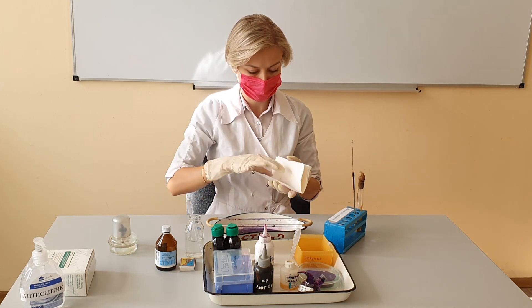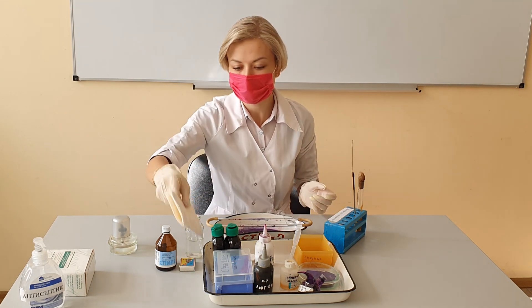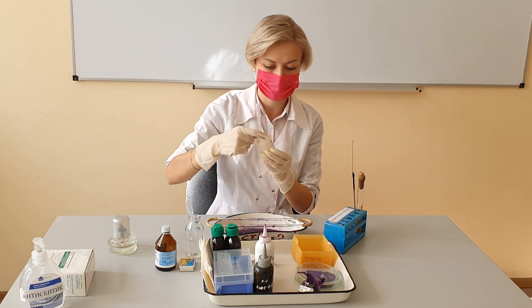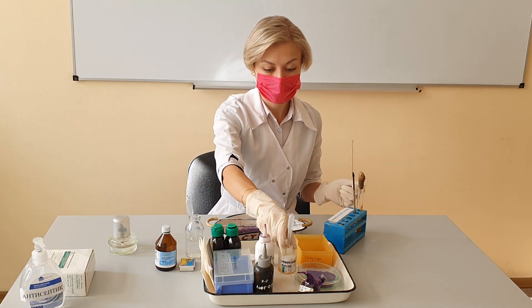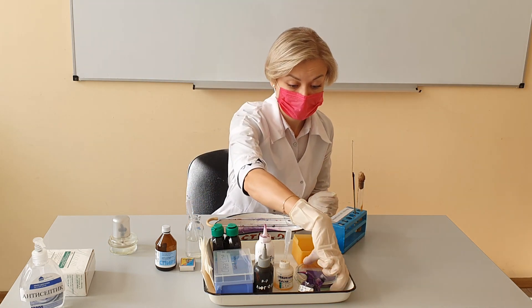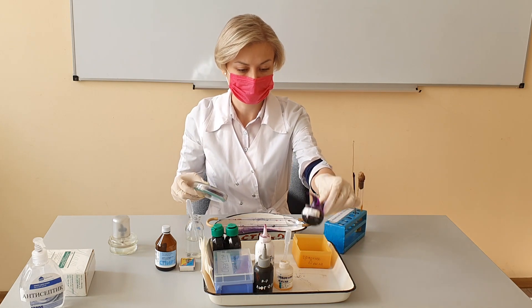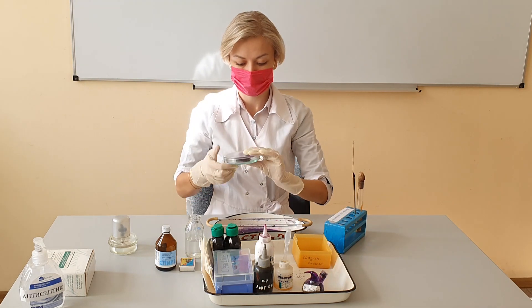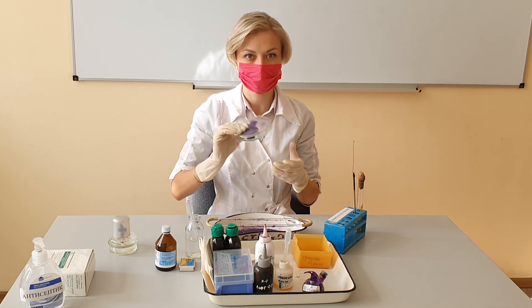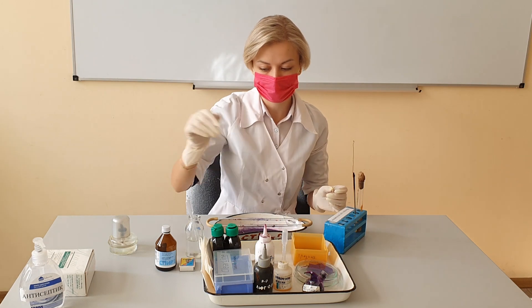It is necessary to examine bacteria under a microscope using immersion oil. In light microscopy, oil immersion is a technique used to increase the resolving power of a microscope. Instead of the liquid dye crystal violet, we can also use filter paper impregnated with this dye, which must be moistened with water after being applied to the glass. This will be the gram method in the Hucker modification.